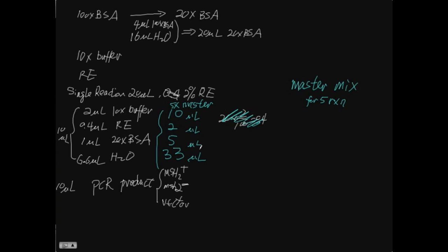And then you should have 3 fresh small Eppendorf tubes. Each one should be labeled with a sample name of your PCR product. And in 2016 spring, this should be named SP0, SP1, SP something.